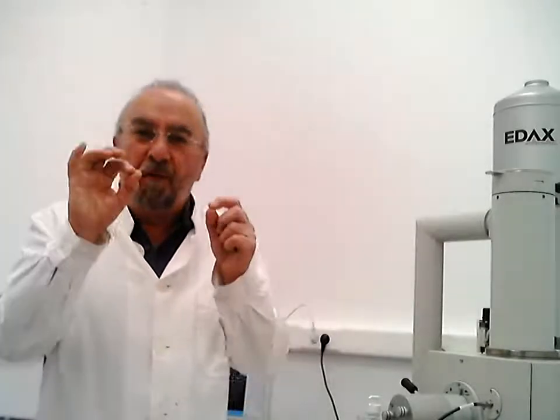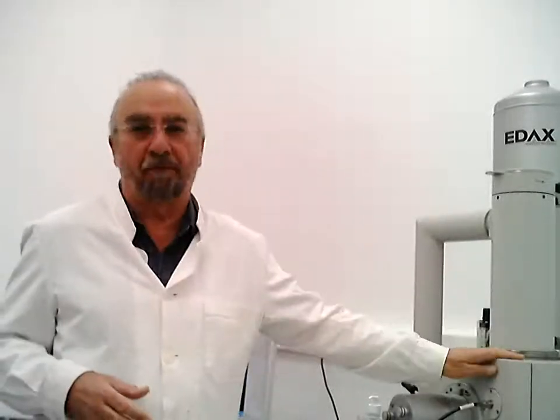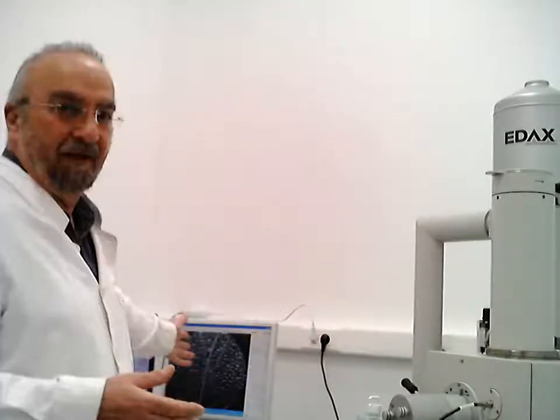Forensic scientists look for absolutely small, tiny particles, tiny evidence, and then you can analyze it in many different ways. But one of the most important tools that we have is the electron microscope. The electron microscope is like a microscope. It gives us a picture, but it doesn't work with light, it works with electrons.